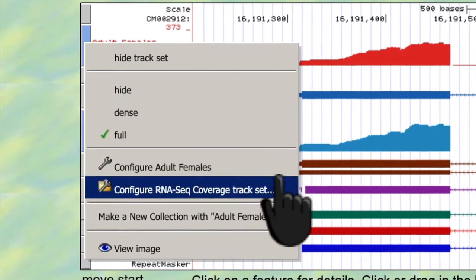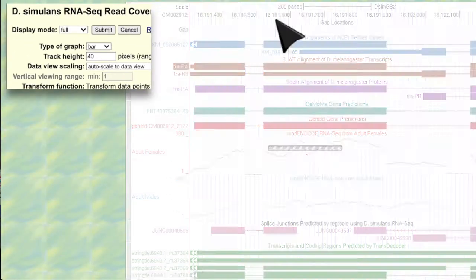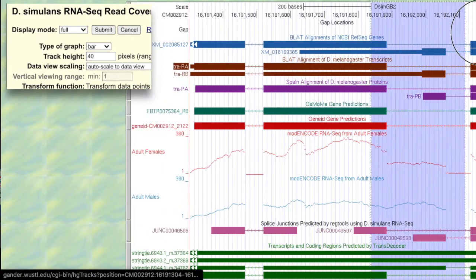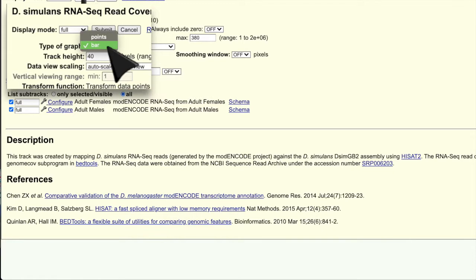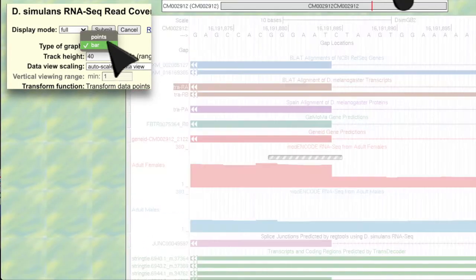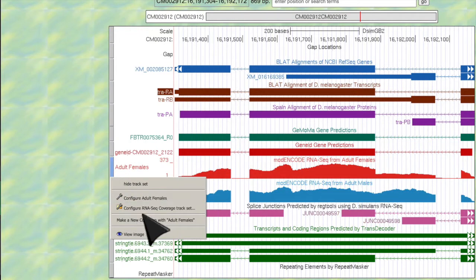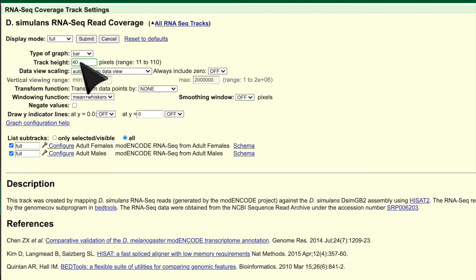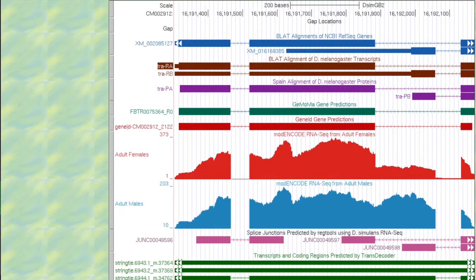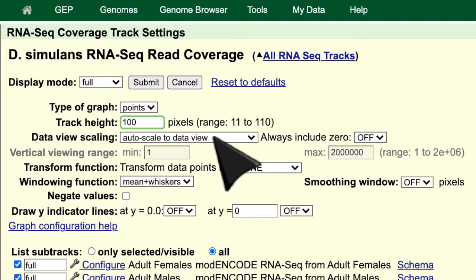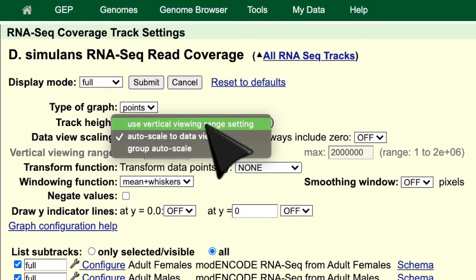We can change the type of graph from bar to points to see another view that might make it more obvious where the differences in expression levels occur, by focusing on the maximum expression level per nucleotide. Another thing we can do is change the height of the track to improve vertical resolution, and we can also change the scale at which the vertical data is displayed per track.